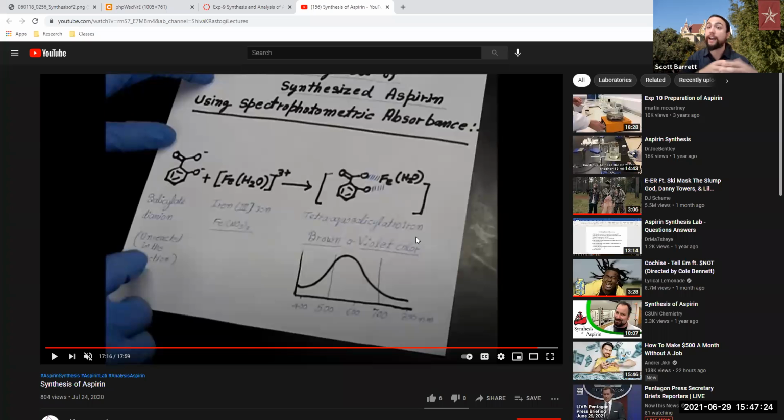And you, of course, have your final product because you've weighed it on the scale, but you need to remove the salicylic acid from it, because you would otherwise still have salicylic acid present in your product.